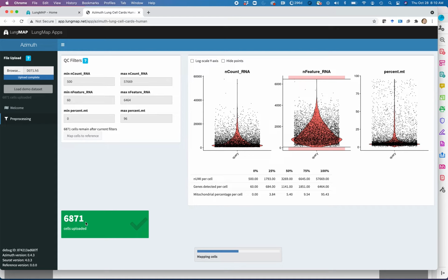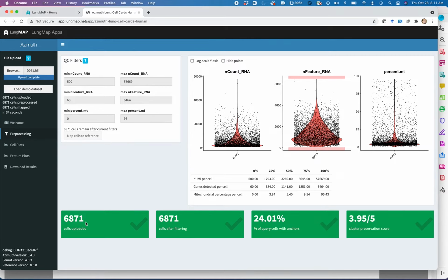The potential advantage of a supervised analysis is that there are prior annotations that have been carefully considered and curated from previous studies, which you can see how those match up to your unsupervised results. If your data sets contain other cell populations that are not in the supervised reference, that may be a problem for classification with a tool like Azimuth, and a potential advantage for an unsupervised approach, such as ICGS.